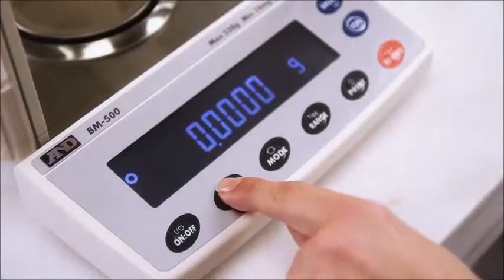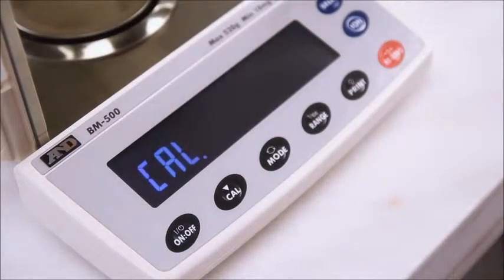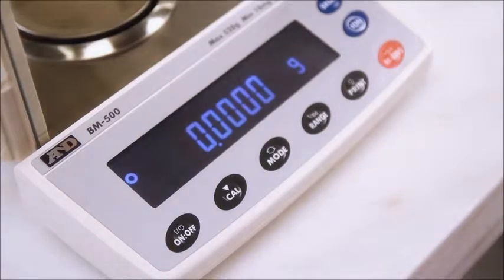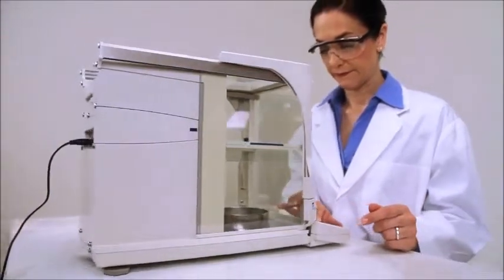Other standard features add convenience and capability to all six models. All BM models are compliant to laboratory and industry standards. Internal calibration is built-in and always available with a single key press, or the balance can automatically self-calibrate in response to changes in the environment.